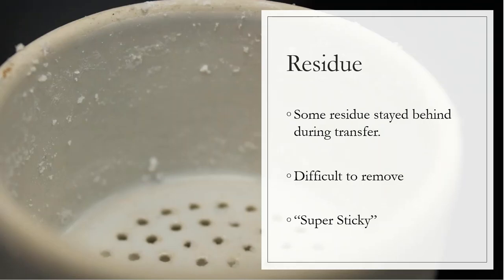All right, so I still see a little bit of residue that's left over in my Buchner funnel. You can clearly see that not all of that was transferred over for me to get a weight. Again, I tried and tried and tried, scrape, scrape, scrape, but the more I was scraping, the more that was just getting left over. So that was going to be pretty much stuck, and it was being kind of stubborn. So I had a good enough amount, I felt really good, to be representative of what we ended up with.